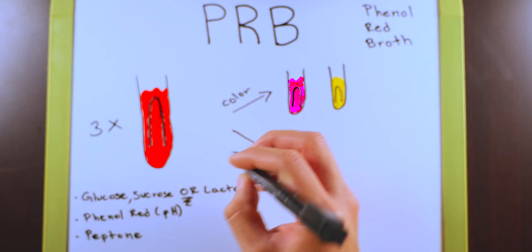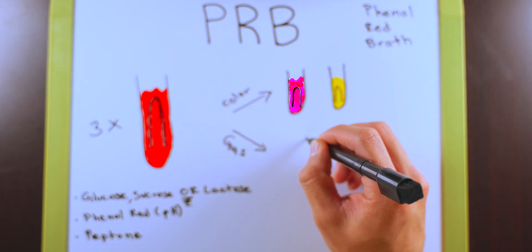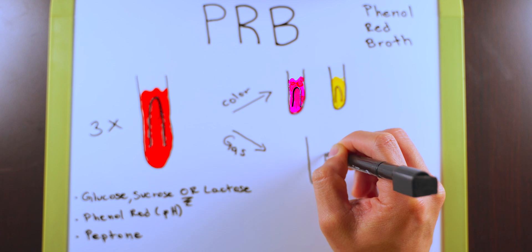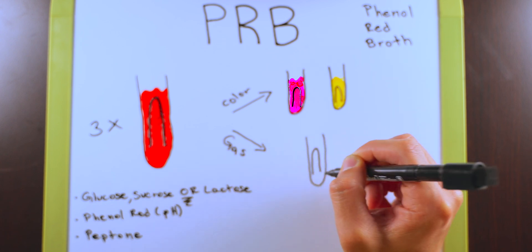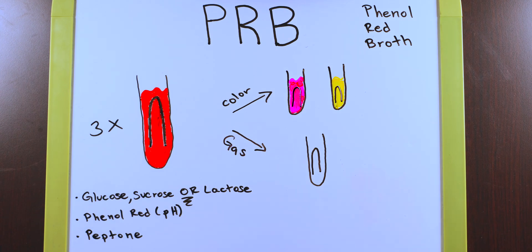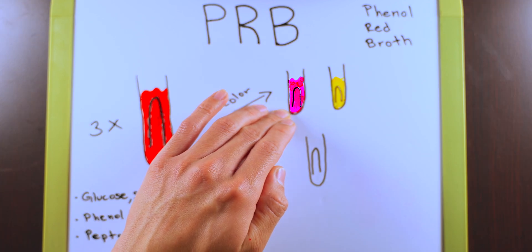The other thing that we want to look for is if we have gas production. For this, we're going to want to turn to our Durham tube. So it doesn't matter whether you have a pink or a yellow test tube, you want to look carefully at the Durham tube and see if there's any gas production. It's also going to be helpful if you grab a control and you can use the same one that you did to determine whether you have a pink color change or not.